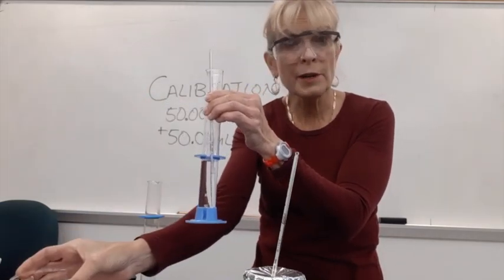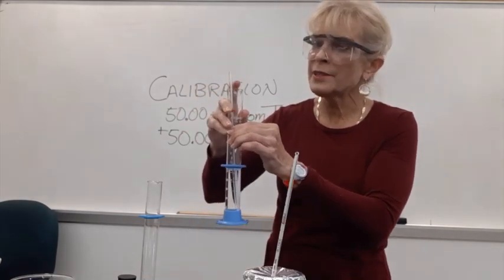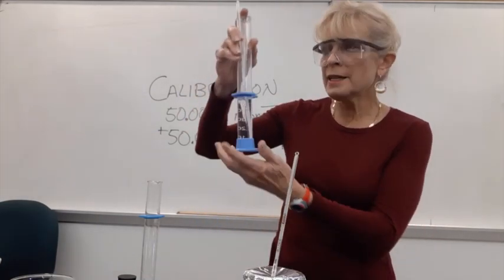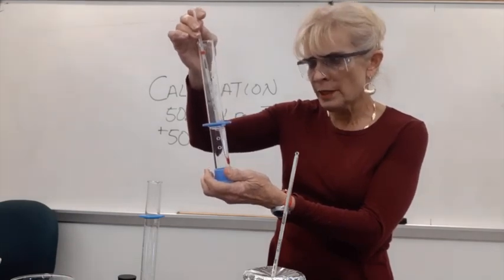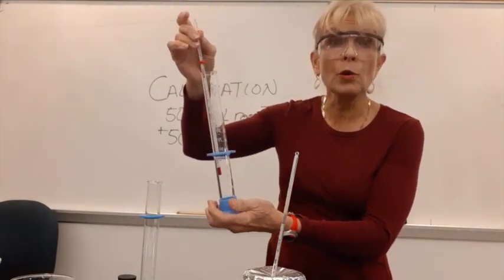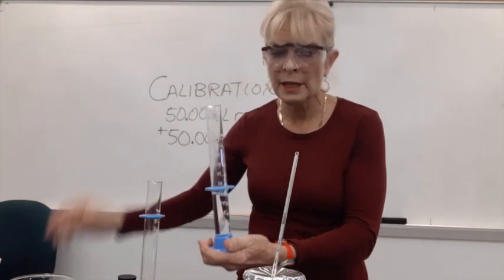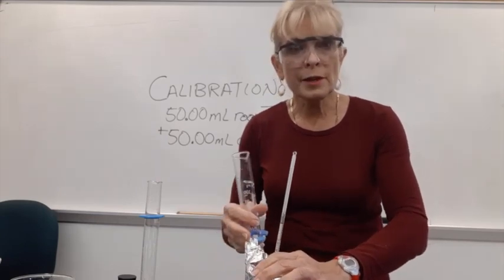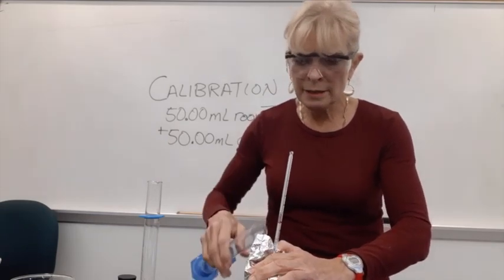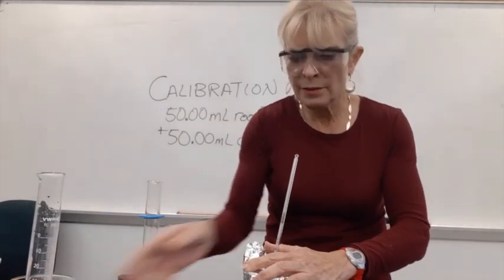We don't want any wet ice in there because that would absorb some heat as it melts. And we read the temperature of the ice water, which is nice and cold, but not really quite zero because it's no longer in contact with the ice. Okay, so when we're ready to start the experiment, we pour in the ice water and start the timer.